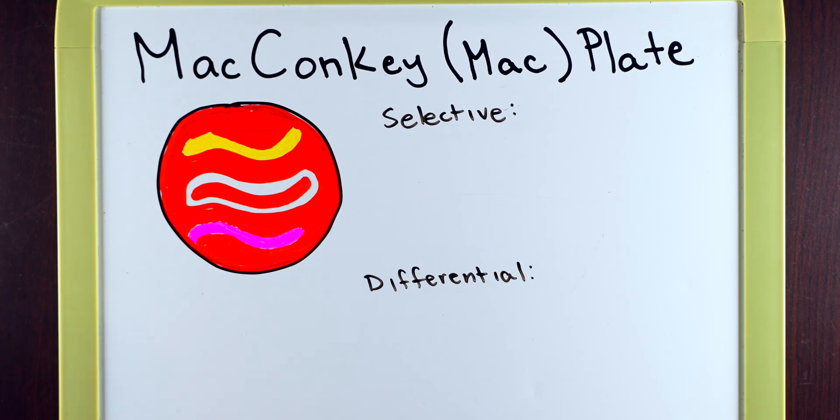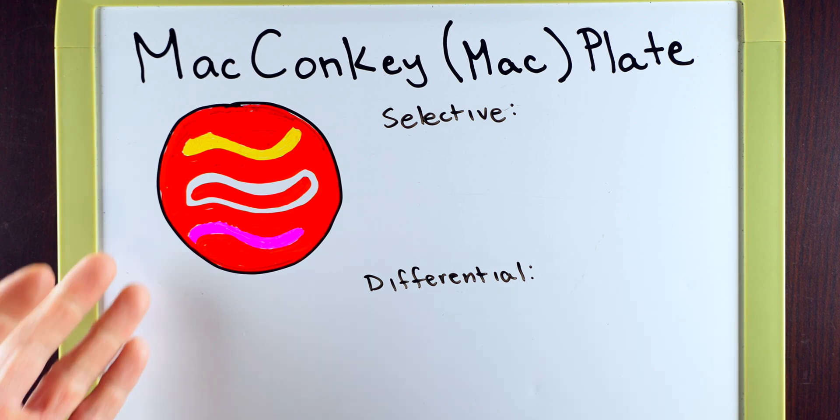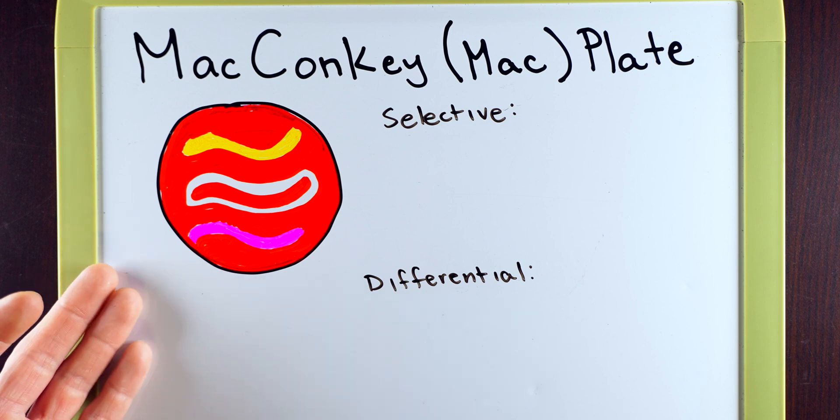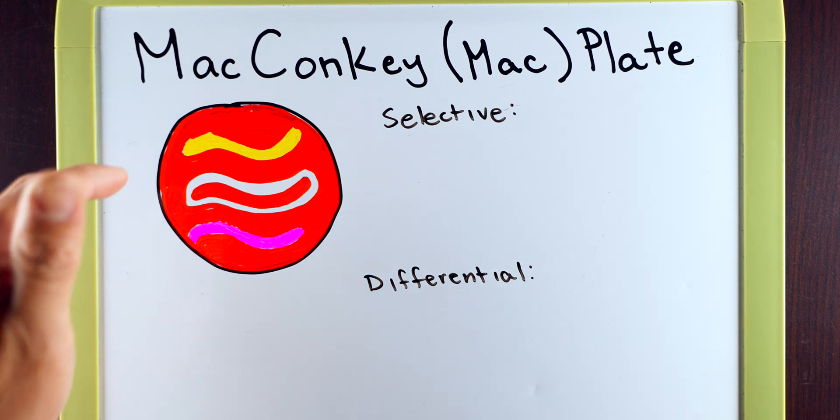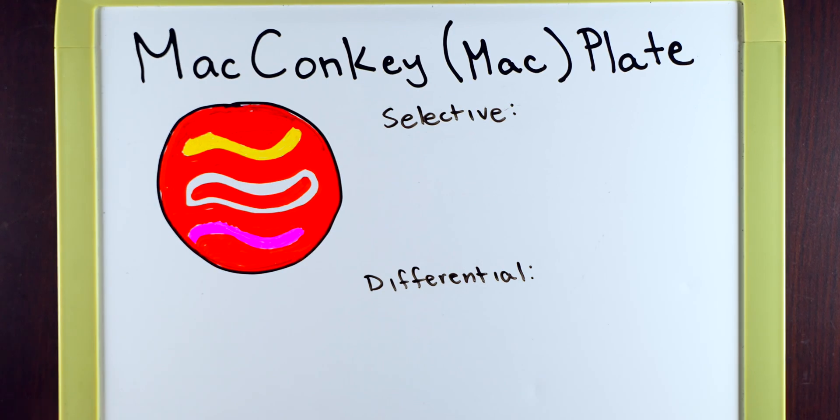Before we get into what these two things mean, let's first look into the procedures of how you're going to do this lab. It's actually very simple. You're going to be given this plate which has this red pigmentation to it and all that you're going to be doing is streaking three different bacteria across it with a q-tip just like this. Pretty simple, just using aseptic transfer.